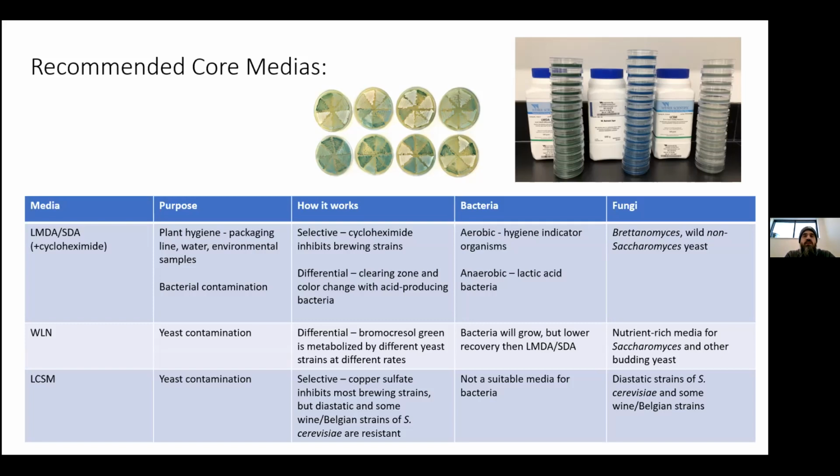So if you want a false sense of security, it can be a very good thing to use. Once it gets a week old, you're never gonna see anything grow on it. So everything's roses. But seriously, it's something you want to use within 3 days of making the plates. So it's something you have to be comfortable with making these plates yourself. You can't buy a sleeve of plates from a manufacturer and hope it's going to work.